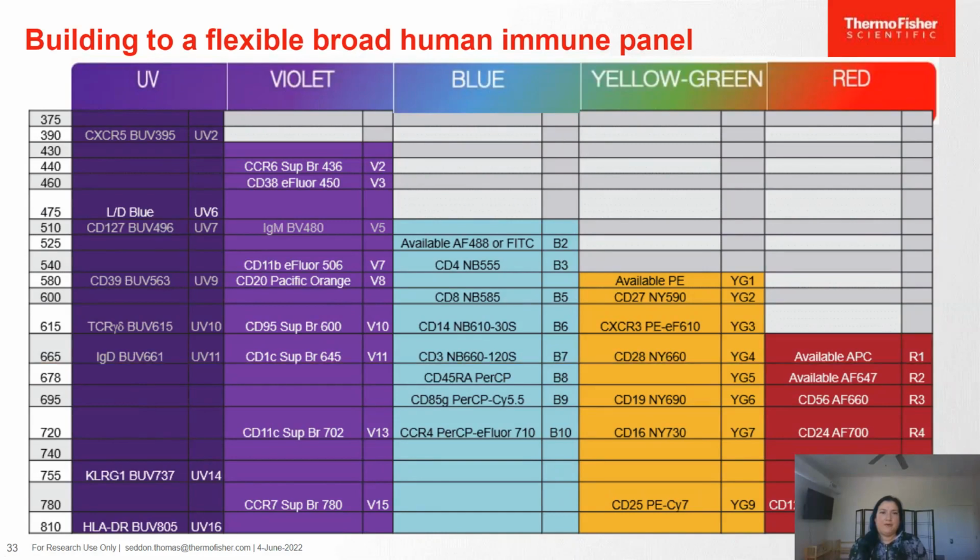And so the other thing that I wanted to look at also was the same thing. So looking at positioning, CD4 and CD8. Even though those are both on T cells, you can position them here because they are still on separate T cell populations.